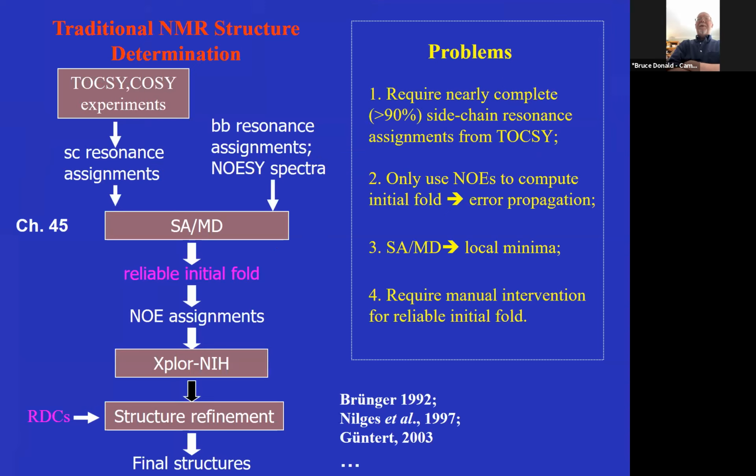All right, so let me try to motivate this by contrasting the different pathways through the NMR process. As we've been reading about, you might do TOCSY and COSY experiments to determine through-bond connectivity and assign the backbone, even assign the side chain resonances. You have to have every spot assigned to a tuple of atoms. For the HSQC, it's a pair. For 3D NOESY, it's a heavy atom and 2 protons. For HNCOCACB, it's 3 backbone atoms that are in a distinguished subgraph.